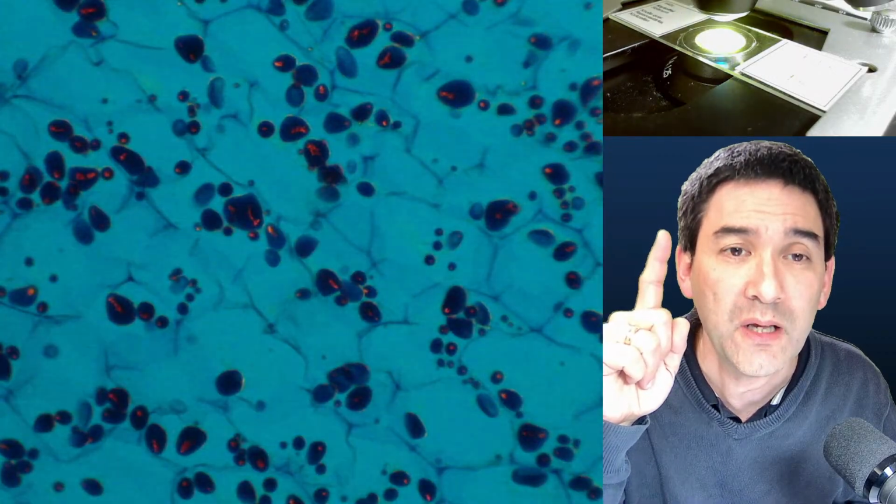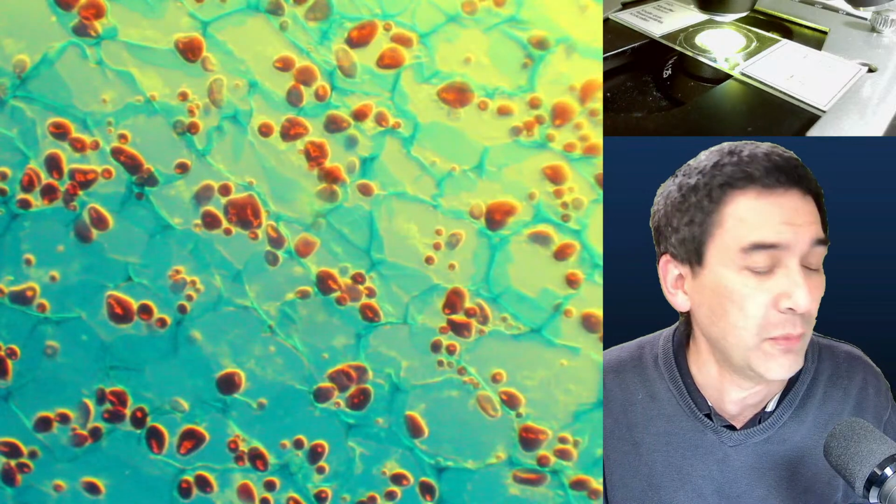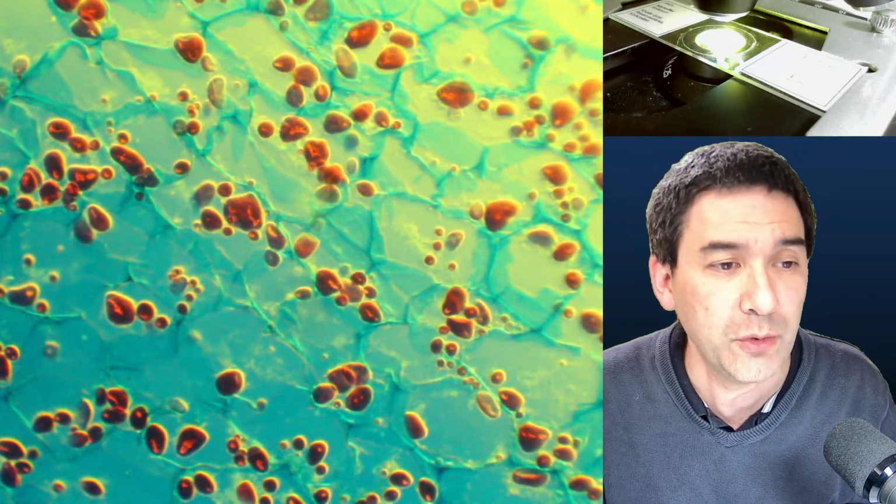Okay. So what I'm going to do is I'm going to show you now some of those filters here and how they are put together.